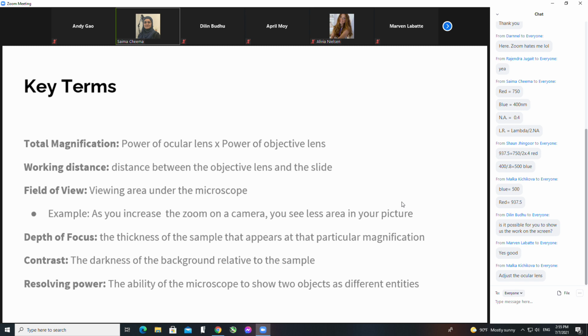And so the depth of focus reduces as you increase magnification, which means that you can optically slice this image and you can look at it in various depths. So if you've ever looked at the cross thread phenomenon, where you look at the red thread and the blue thread and the yellow thread, under 4X you can't really tell which one is on top, or you can't focus on just yellow if you wanted to.